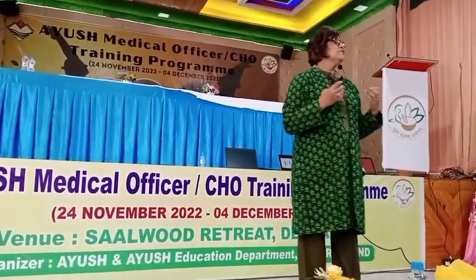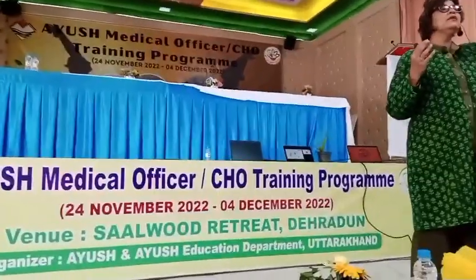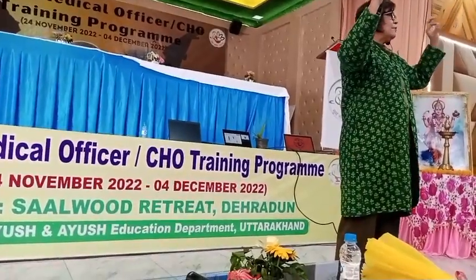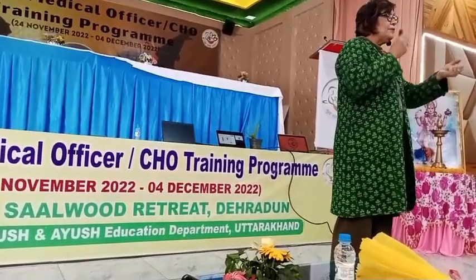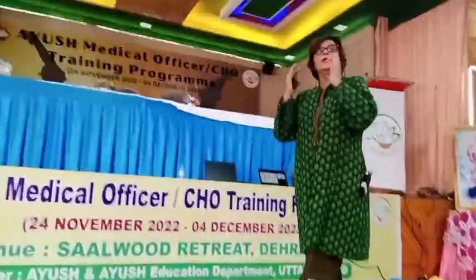Now, if you don't centrifuge the sample very well, fibrin comes into the serum, and fibrin consists of strands. What is fibrin? Strands. Fibrin is taken for what? Clotting. In the blood, fibrin is used for clotting. For example, when we are bleeding, fibrin is activated to stop the bleeding.